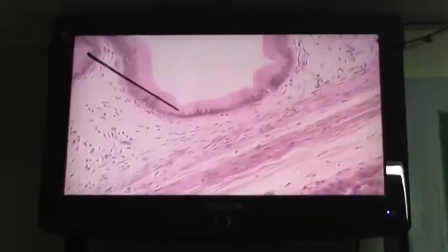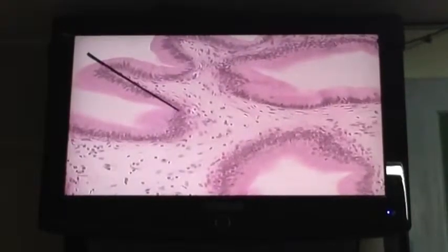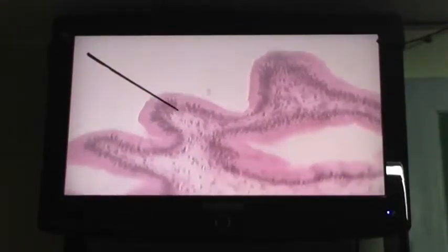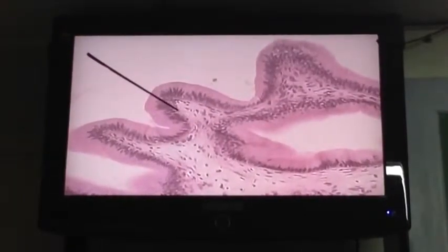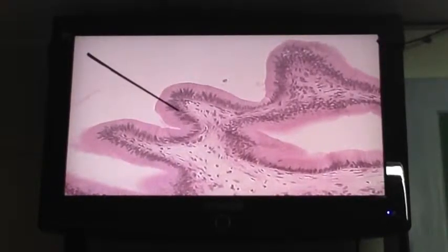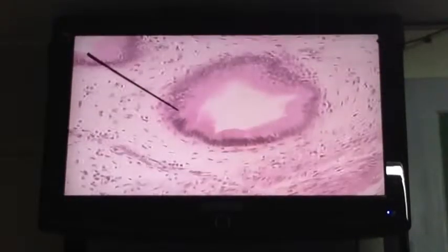If we move up, you would see this. This is the gallbladder. Now, what are the layers? So this is the lumen, from innermost going out. So this is from here to here. This is the mucosa. And you know the mucosa is lined by an epithelium resting on a lamina propria. So we'll go back to that.